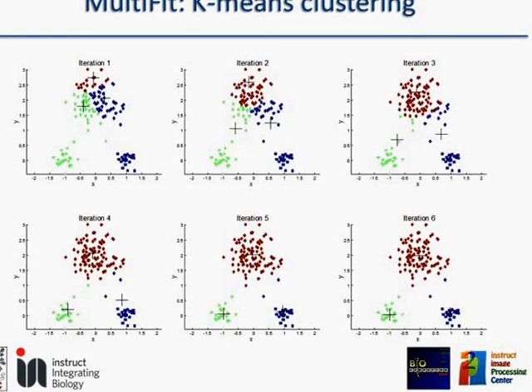So all points that are closer to this initial point are going to be green. The same for that point. So for example, these points here are closer to this point than to these or these. Then these points here are blue. Then I split our initial set into 3 sets depending on the distance.